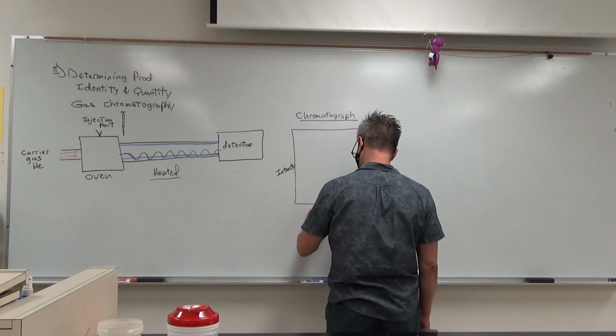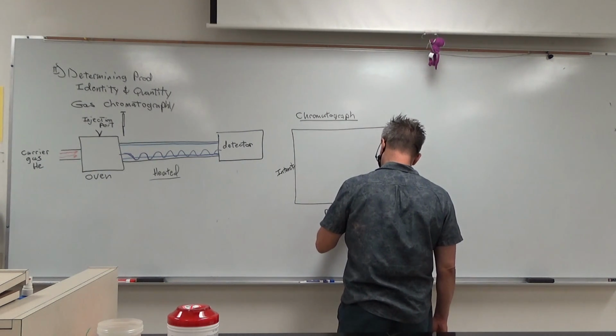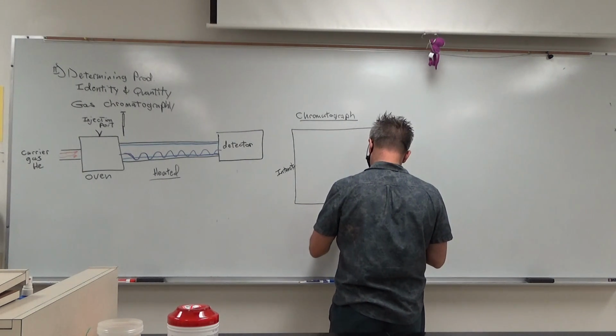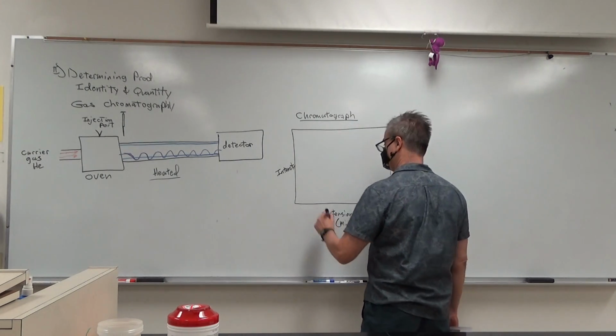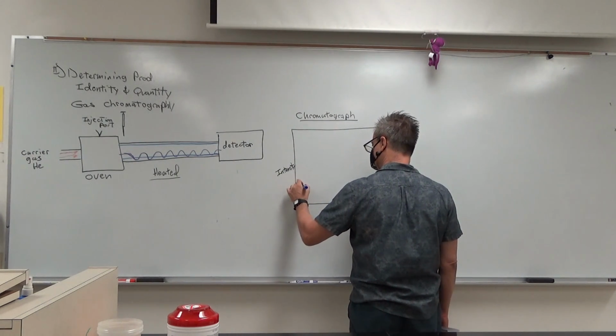And here is retention time, in minutes. And so what you tend to get is stuff like this.